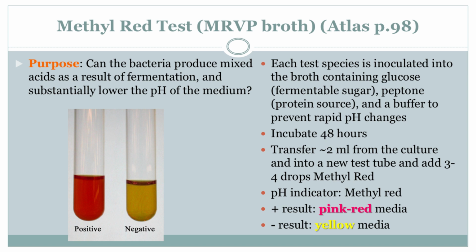food. And we're talking specifically about... Glucose. Primarily glucose. Okay, so why is that so important? Why do we care how bacteria break down glucose? Because it helps us tell them apart. You see, just like you might prefer a salty snack and I might want something sweet, different bacteria break down glucose in different ways, producing different byproducts. The methyl red test helps us identify those byproducts and from that, identify the bacteria.